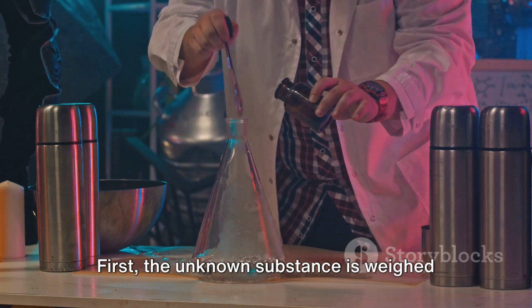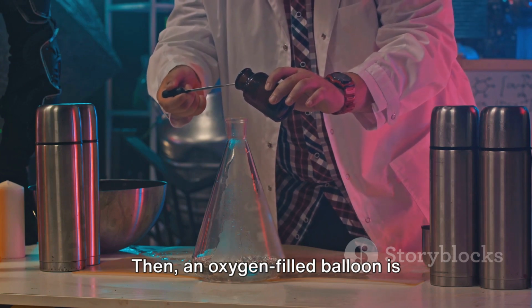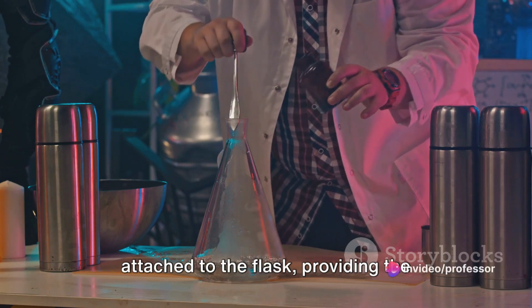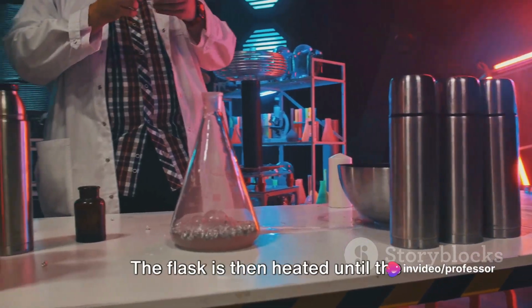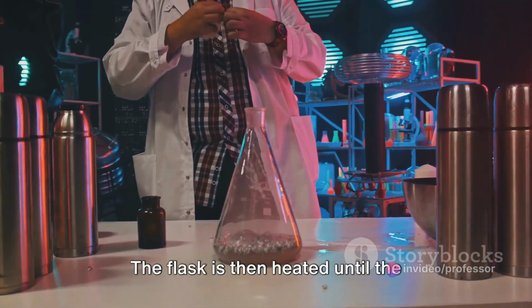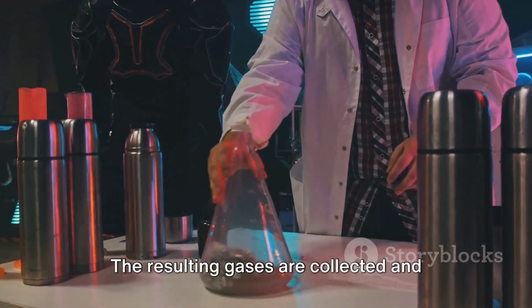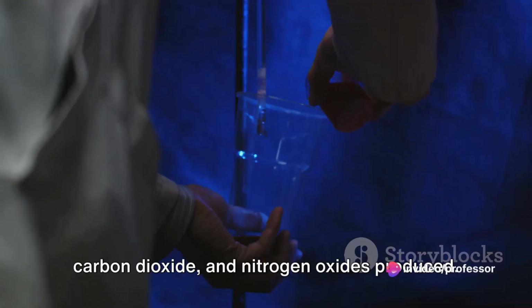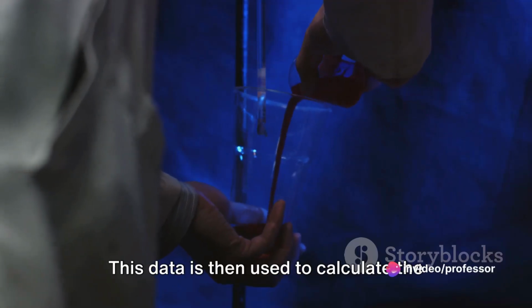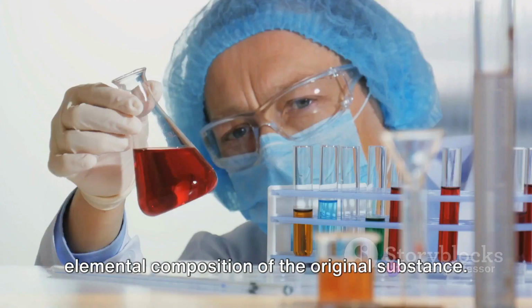First, the unknown substance is weighed and placed into the combustion flask. Then, an oxygen-filled balloon is attached to the flask, providing the necessary excess oxygen for the combustion process. The flask is then heated until the substance is completely combusted. The resulting gases are collected and analyzed to determine the amount of water, carbon dioxide, and nitrogen oxides produced. This data is then used to calculate the elemental composition of the original substance.